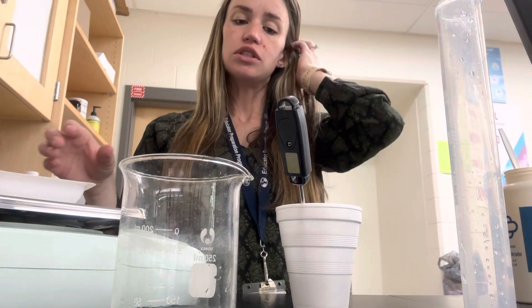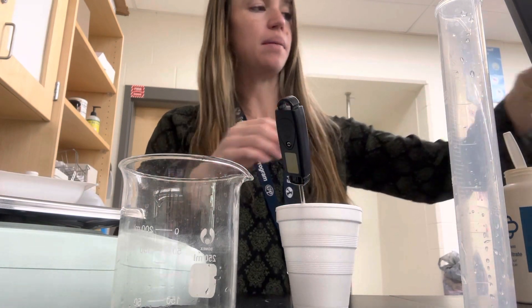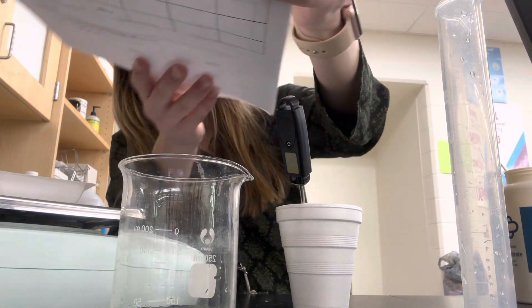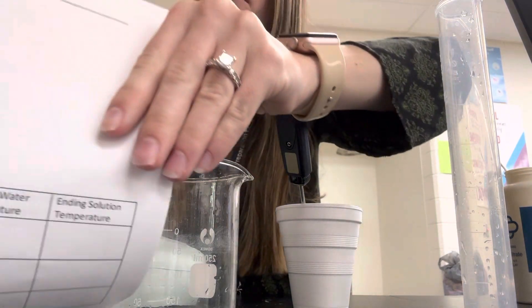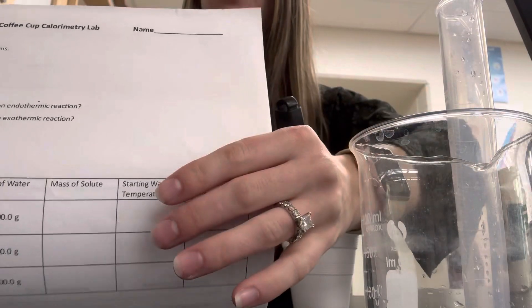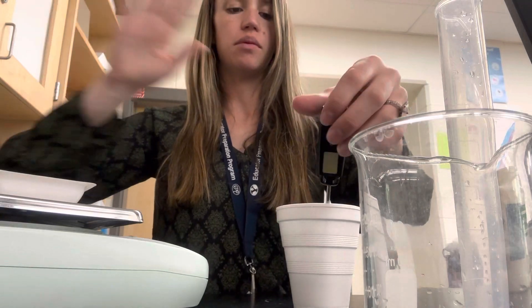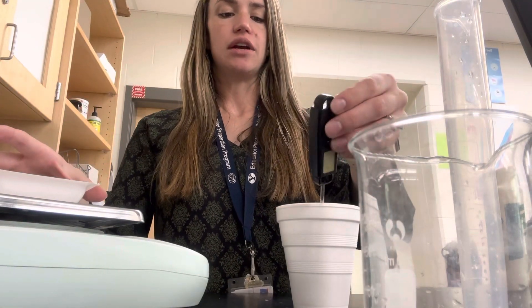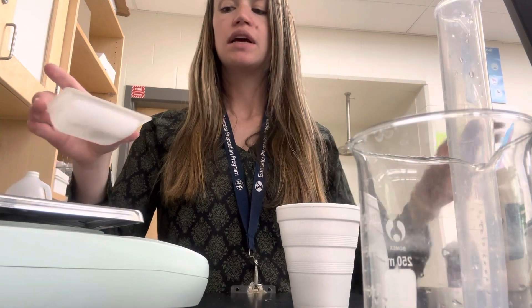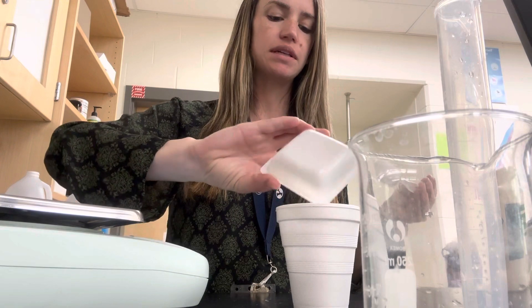Then record the temperature on your paper — the starting temperature of your water is what you record from your thermometer. Record that temperature on your paper. Then take your thermometer out, put your solute into your water, and mix it so it dissolves.